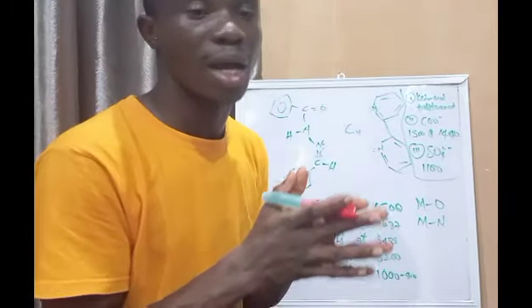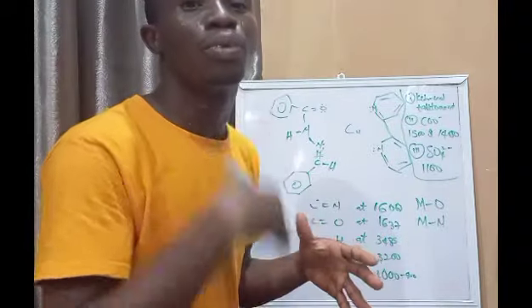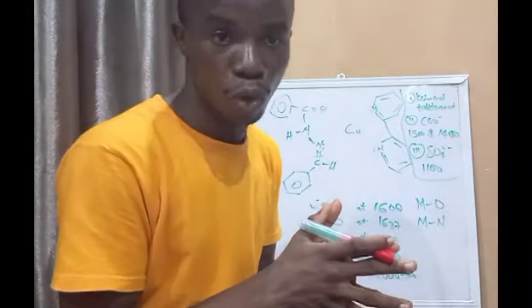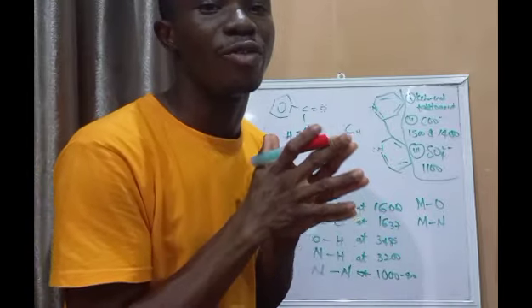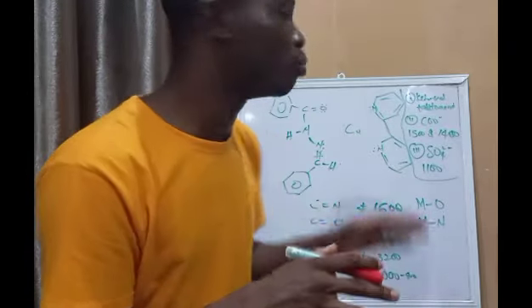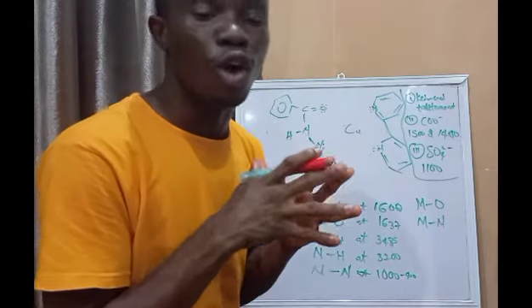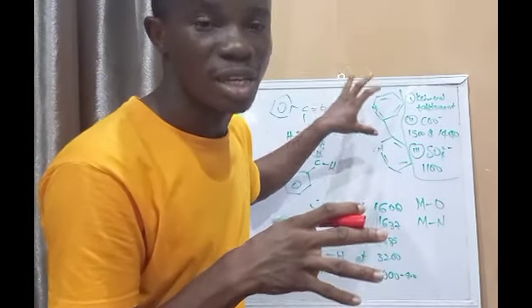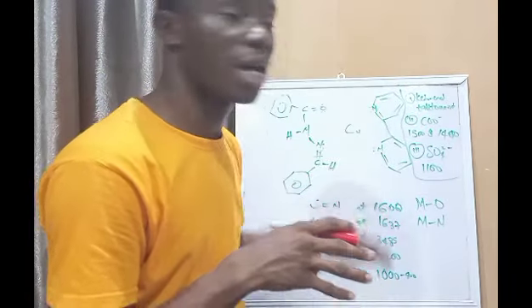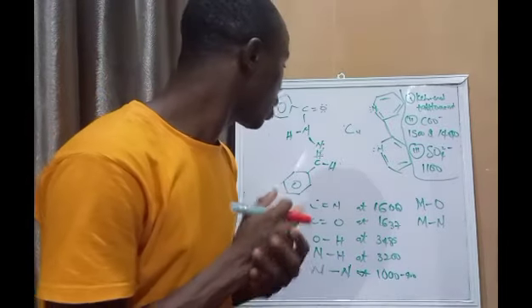I will talk about that later, because in some ligands, deprotonation might occur. And that's why I said the kind of ligand given to you is a very key thing to take note of. But I'm just using, like I said, this hydrazone as an example of an organic ligand that can be coordinated with a metal ion, such as copper, that we have in this particular case.